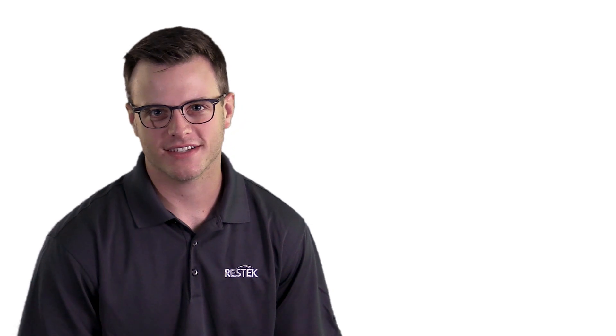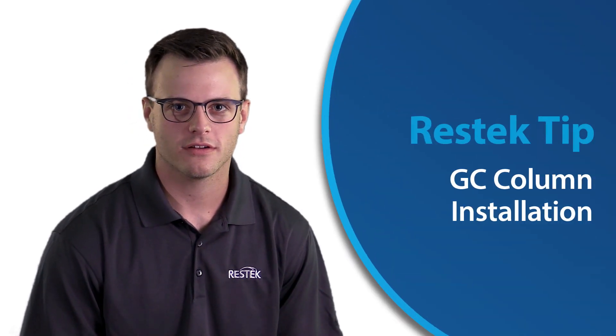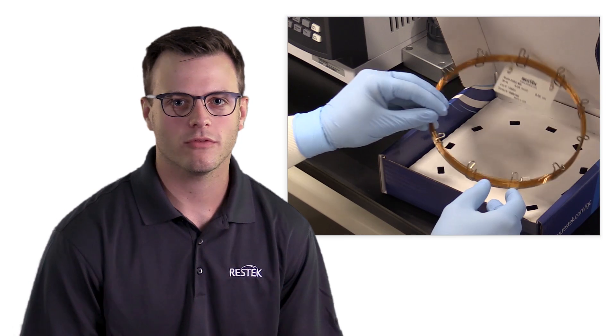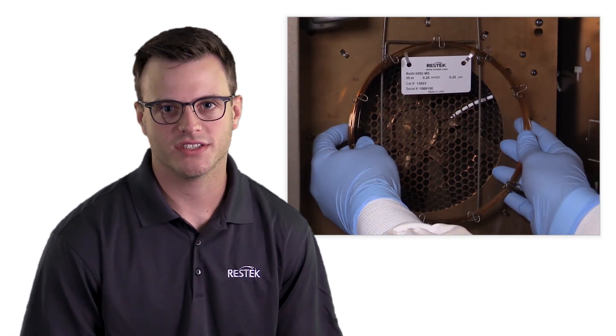Hello and welcome to another ResTech Tip. Today we'll be covering GC column installation. The first thing we'll need to do is cool our GC oven and turn off the instrument flow. Then we'll remove the column from the box and mount it to the rack inside the GC oven.